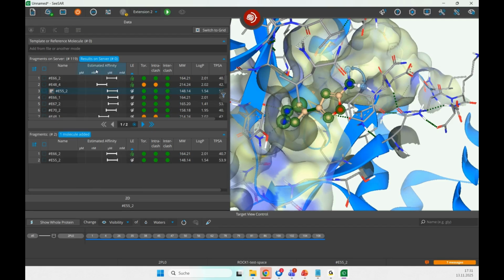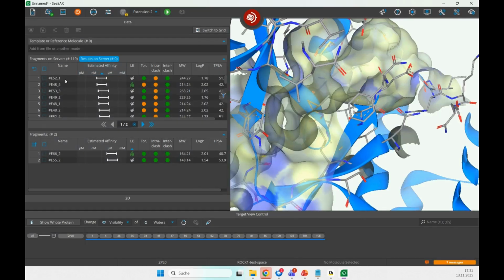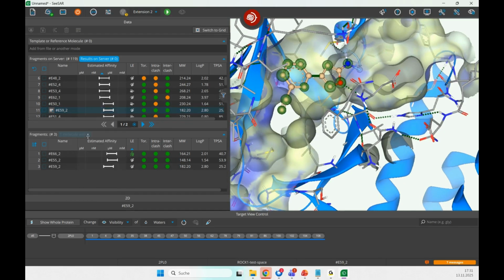Now we wait for a very brief moment. Now basically again, 3 times the final compounds, 30 compounds are now generated with 3D and docked, template-based. Let's check the results. And here we are. So these are the final compounds.